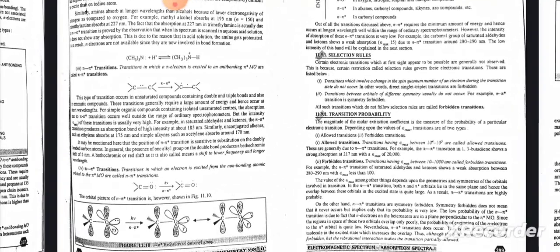For simple organic compounds containing isolated unsaturated centers, the absorption of these transitions occurs well outside the range of ordinary spectrometers, but the intensity of these transitions is usually very high. For example, in saturated aldehydes and ketones, the pi to pi star transition produces an absorption band of high intensity at about 185 nanometer. Similarly, unconjugated alkenes such as ethylene absorb at 175 nanometer, and simple alkynes such as acetylene absorb around 170 nanometer.